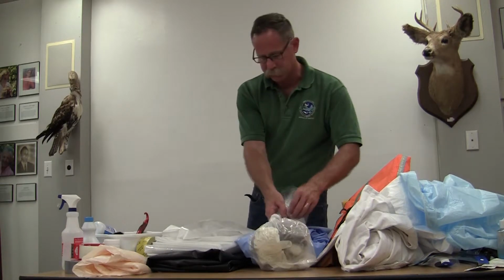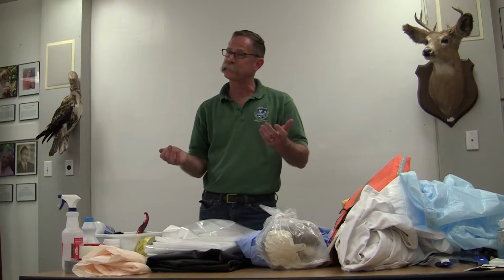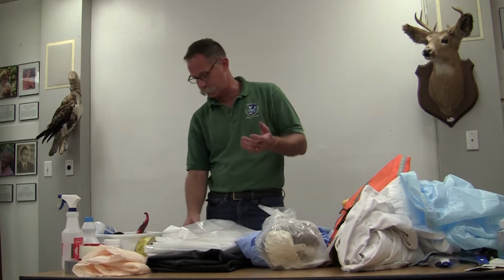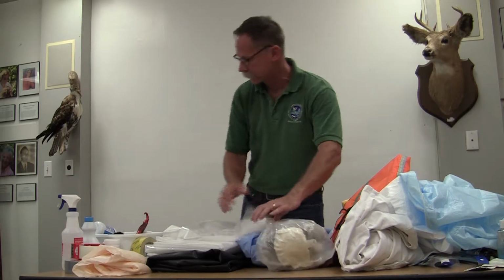The easiest way to close them is with an overhand knot. Other methods include a zip tie, which isn't really as good, but I see a lot of folks in the field like to use zip ties. Another good way to do it is with duct tape.